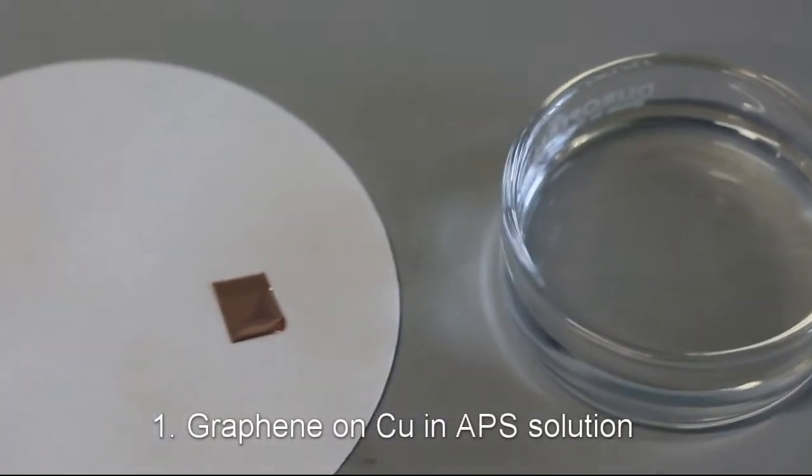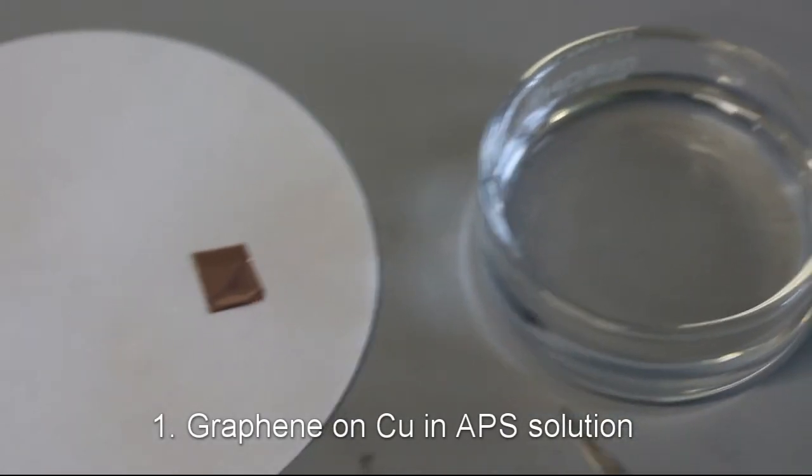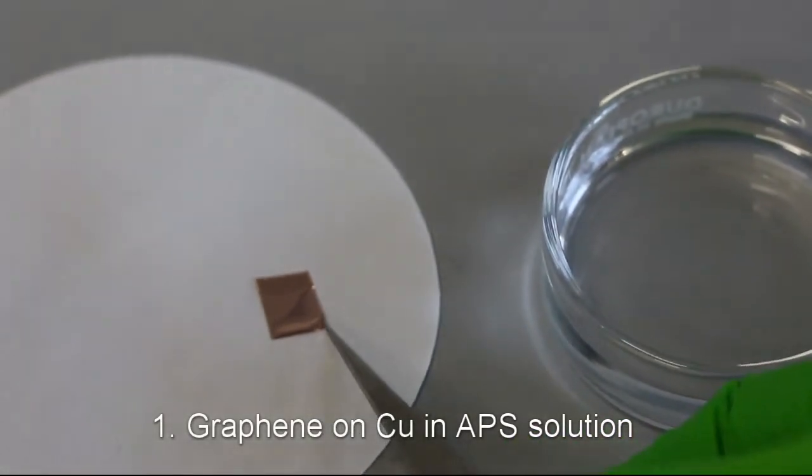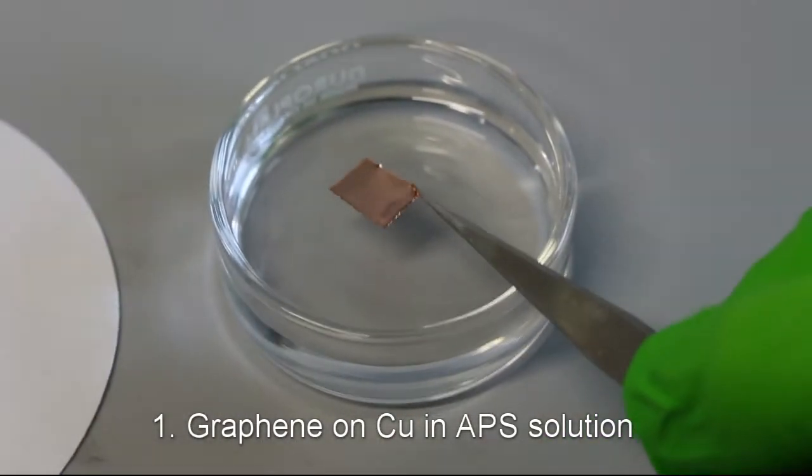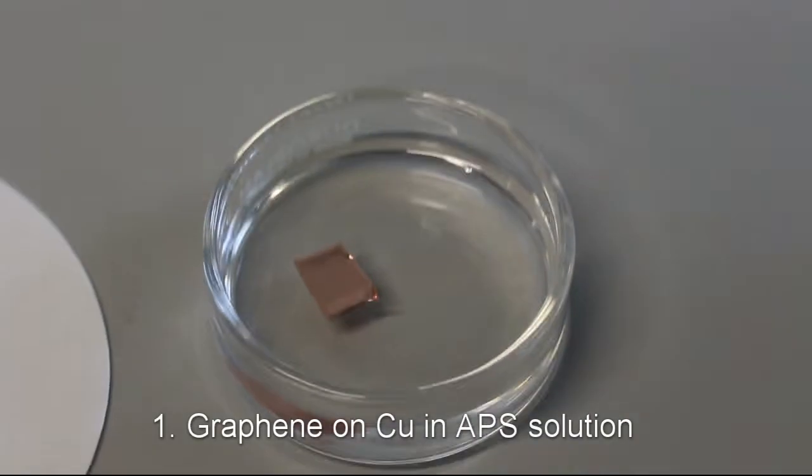For the transfer, we first have to assemble the biphasic interface and graphene in it. For that, we place a sample of graphene grown on copper with a pre-etched backside on the surface of aqueous solution of ammonium persulfate.